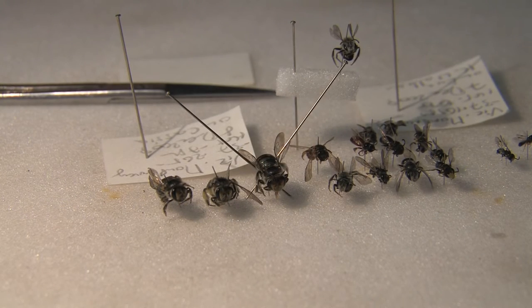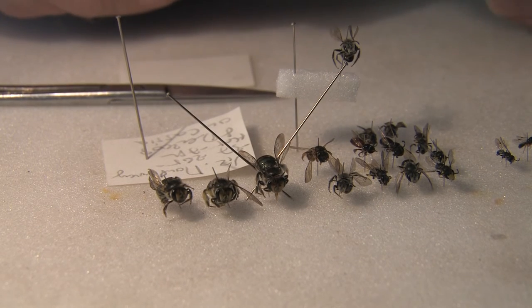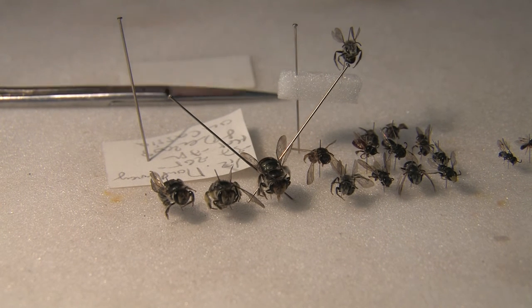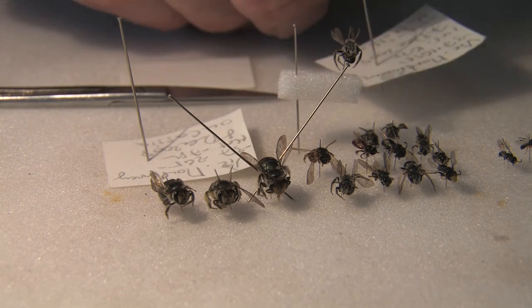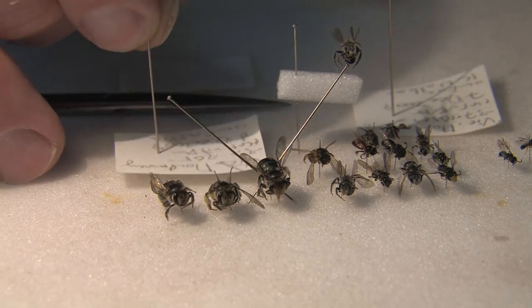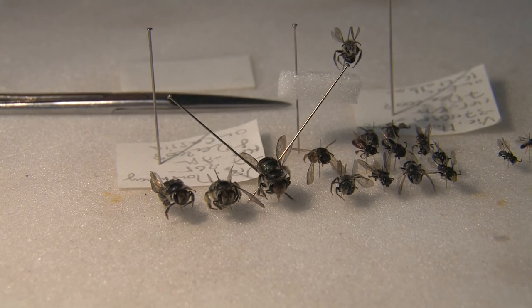The last thing to do before you put the specimens away is to ensure that you've written a label. Here I've got the locality — Montmorency — the latitude, the longitude, the date (7th of November), and the host plant — on Eucalypt. The other specimens from the Cassia get a separate label. So I have two labels, meaning when I put them in a box they'll be easily recognised when we print up proper labels later on.